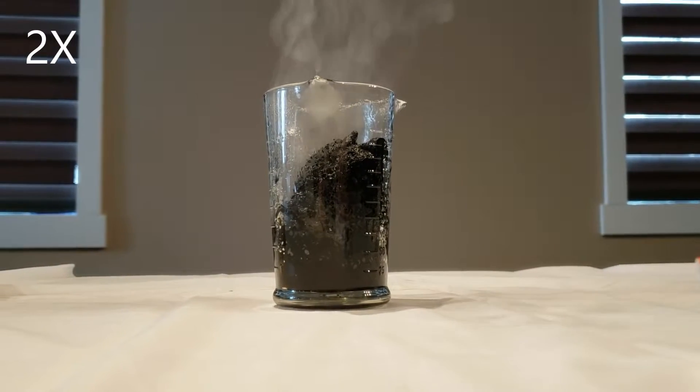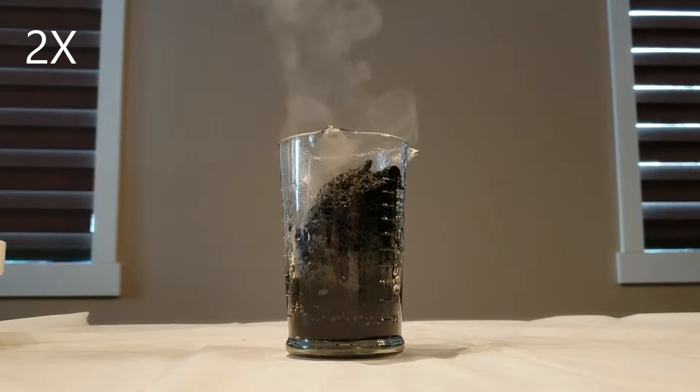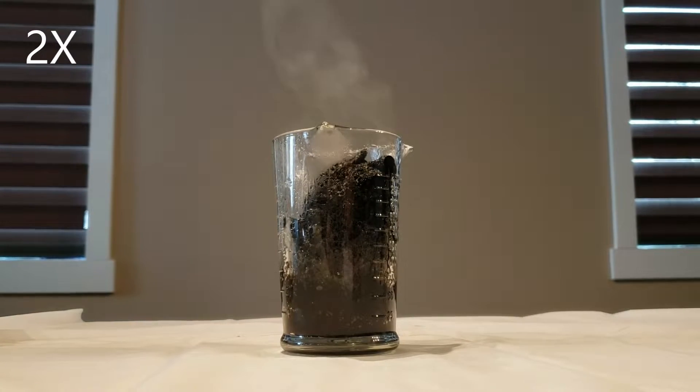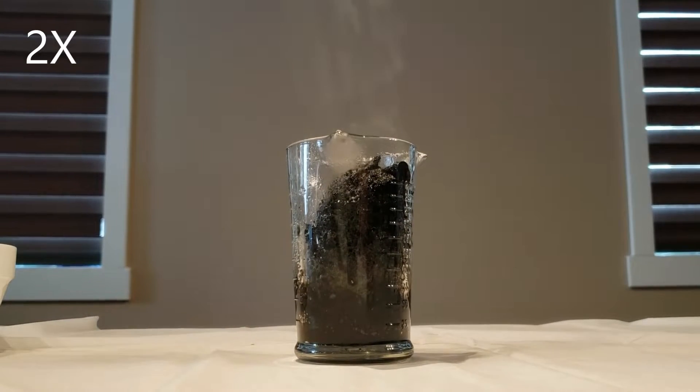You may be wondering what is happening when you mix sugar and sulfuric acid, so I will tell you. The reaction is highly exothermic, so it is creating a lot of heat, and the sugar is turning into water, so the water is turning into steam. Also, the sugar is turning into pure carbon, which is black.